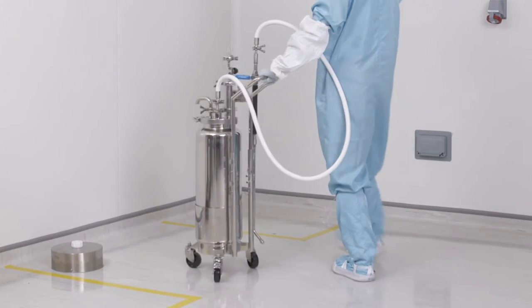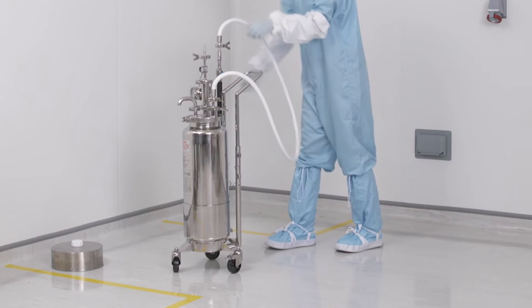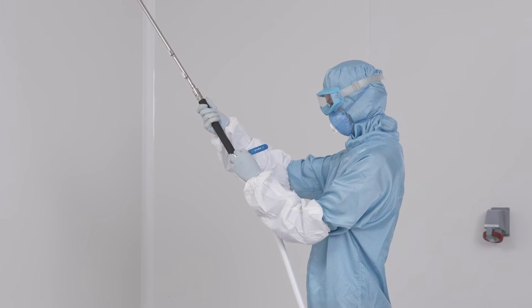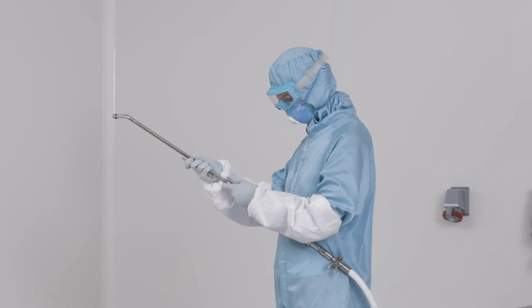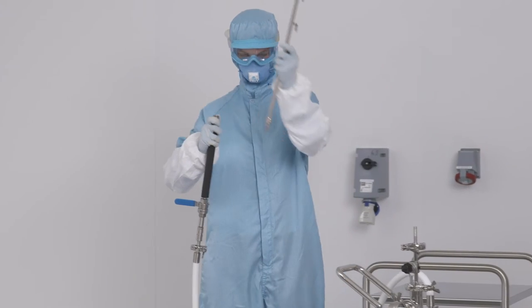Secondly, the quick-fit snap-in lance design can incorporate, without loss of pressure, any number of extension pieces required to reach high ceilings. This removes the need to use ladders or other devices requiring special safety training.